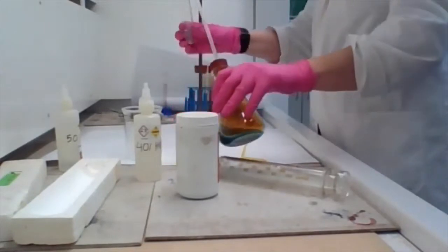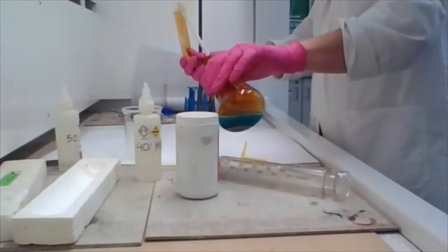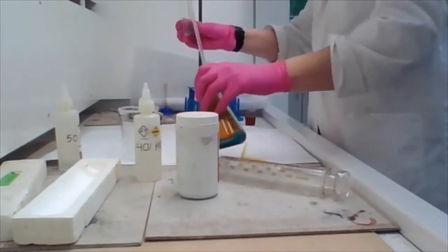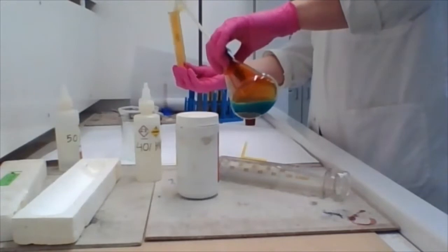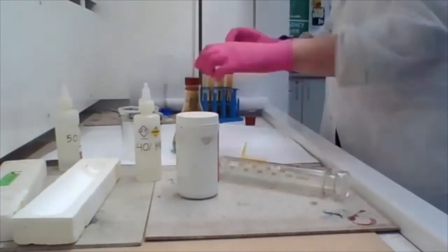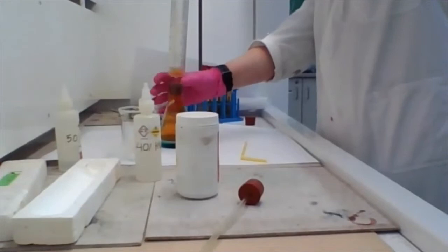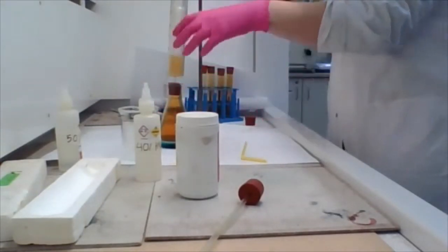So I'm doing 4 test tubes just because it's always useful to do one extra, always over cater rather than under cater. So I'm just filling up those 4 test tubes with that brownish gas. And you can see that the solution in the bottom of that conical flask is that very stereotypical copper blue. Now I'm filling up a gas syringe with that brownish gas.